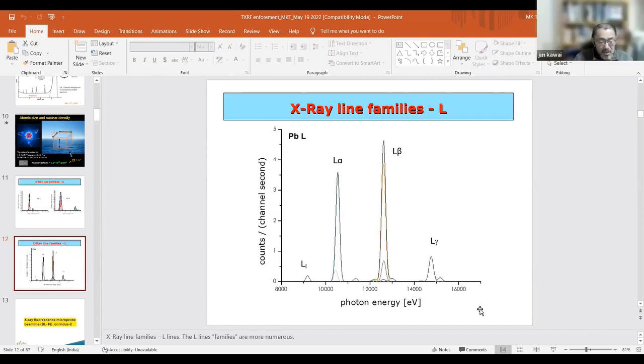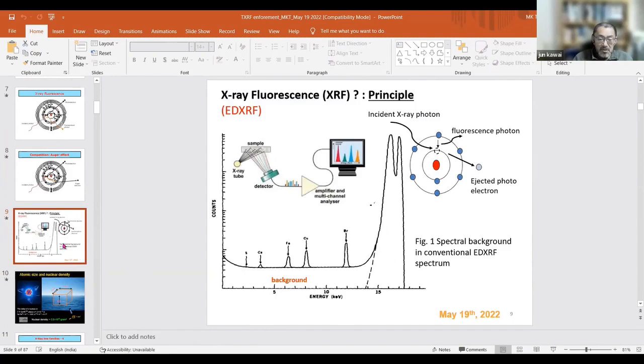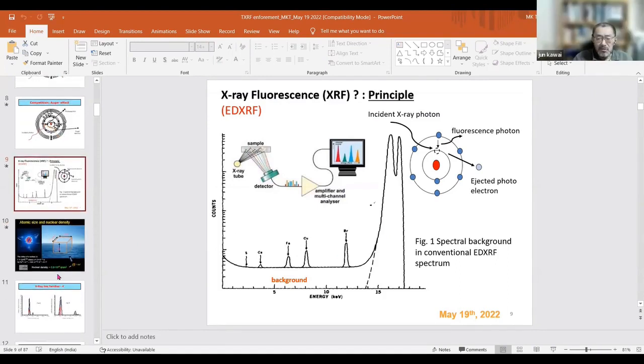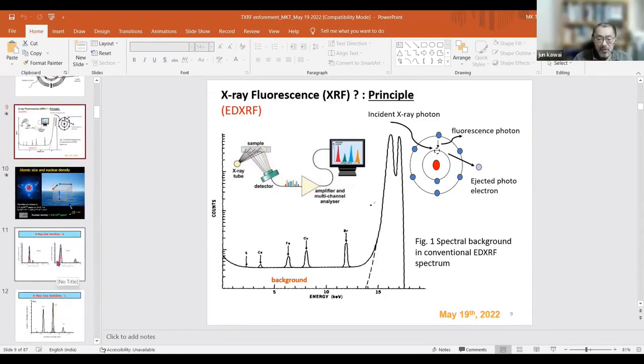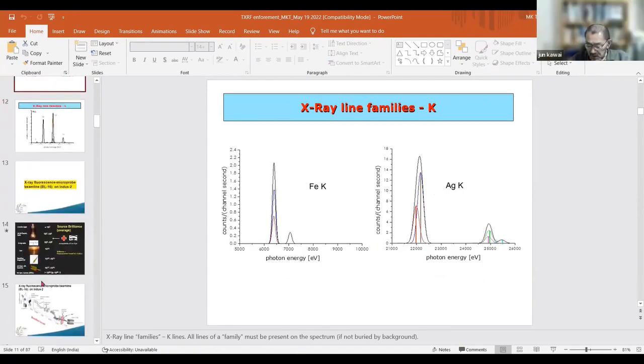And you have shown us a real sample X-ray spectrum just after this. I'm not sure which one. Its L beta was weaker than L alpha, so it's very strange. Which one? It's a log scale, some real spectrum shown afterwards. This one? No, afterwards you have shown us. I'm not sure.